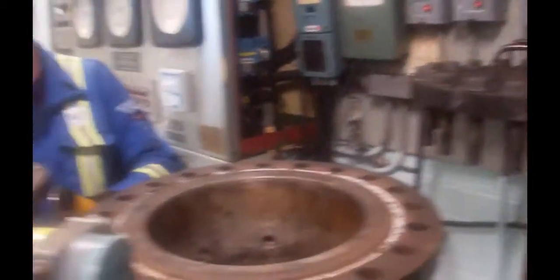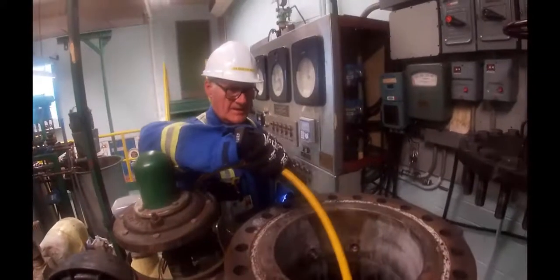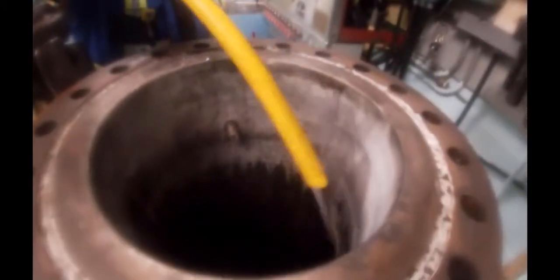We're going to actually wash this stuff out of here with water. So, Charles, I need the hose, please. So I'm washing the liquor off. You can see there's still some liquor on this side here. And look when the water hits that liquor, it just peels right off of there.